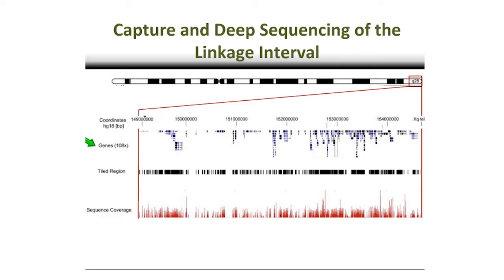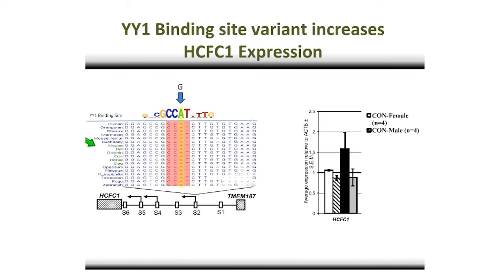So we're really focusing in, getting incredibly deep coverage, and that enabled us to double check and also check into non-coding regions if there are any variants that could explain the disorder. Well, I can tell you, we were a little bit disappointed at first because we came up empty in the coding region, so there were no coding variants. What we did come up with, though, when we looked just outside of a gene called HCFC1, was a very well conserved change in a non-coding region.